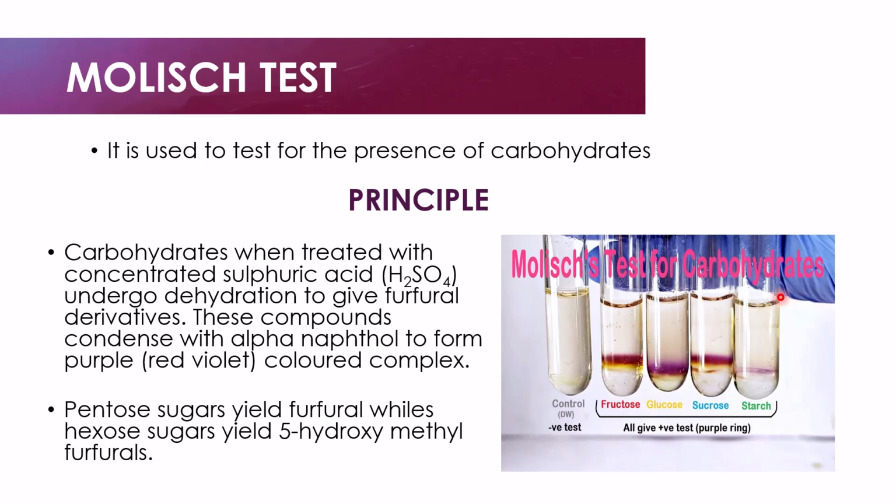And this is a test result showing a Molisch test for carbohydrate with fructose, glucose, sucrose, and starch, which are all carbohydrates, giving a positive test result, and distilled water, which is used as a control, giving a negative result because it's not a carbohydrate.